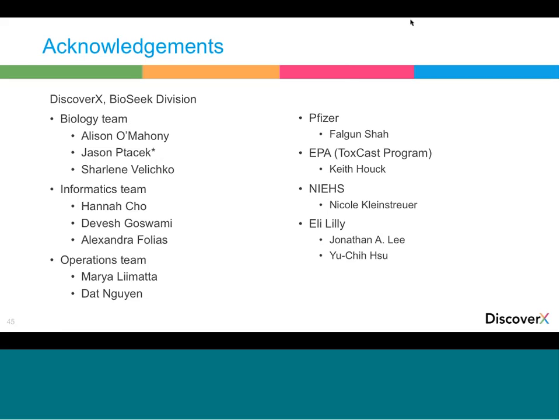First question is, what kind of classification method did we use? So the classification method that we used for the mechanism models was support vector machine.